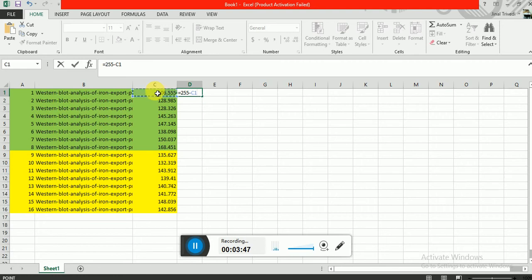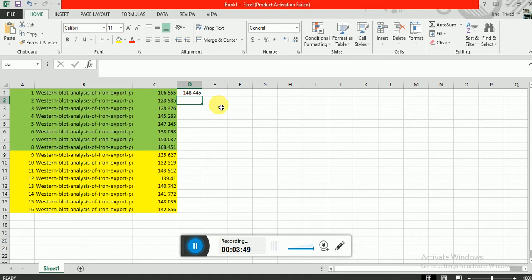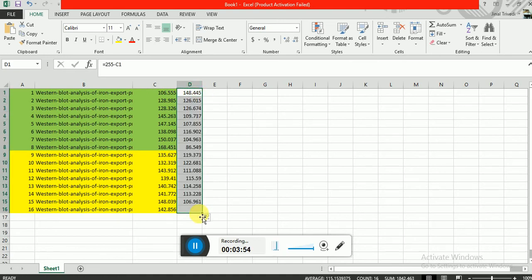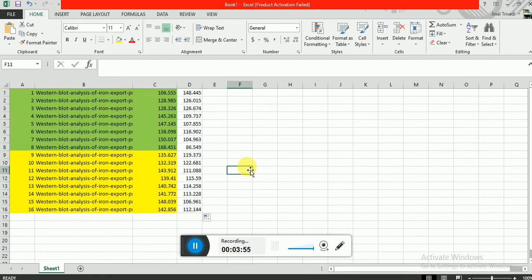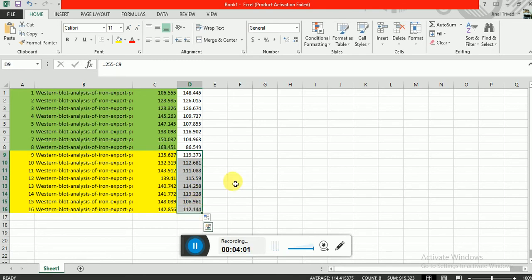Do this for all values, so you will find exact intensity of your band.